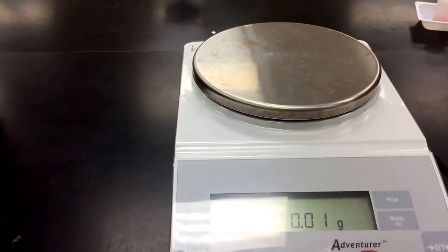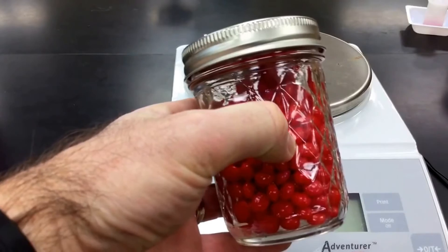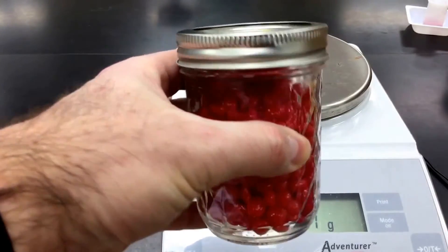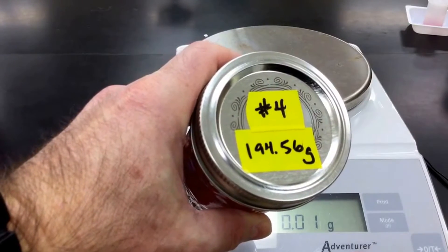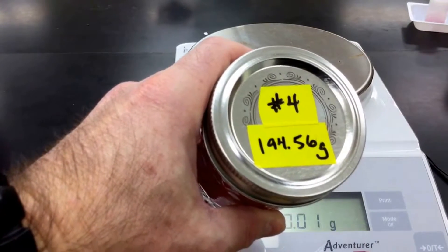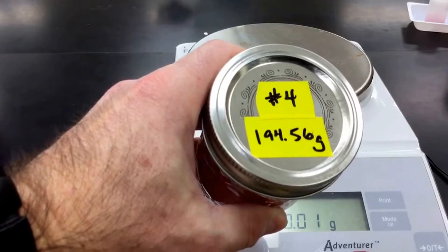So here's our idea. We've got this jar of red hots, and what we want to do is figure out how many red hots are in here without opening them up. We're going to be using our balance and a little bit of dimensional analysis to figure this out. The first thing you want to know is that the mass of the empty jar is written on the top here on some tape — it's 194.56. That's the mass of the empty jar and cap.